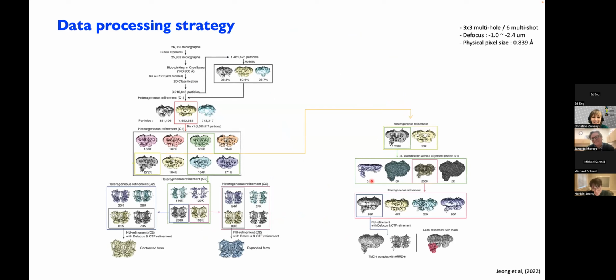Yeah, actually, it is my first project using cryo-EM, and the first time I used CryoSPARC or RELION. So many other lab members helped me to succeed in this project. So yes, I think I just followed the protocols, followed the CryoSPARC strategies.